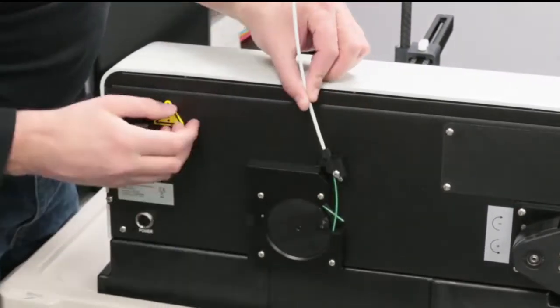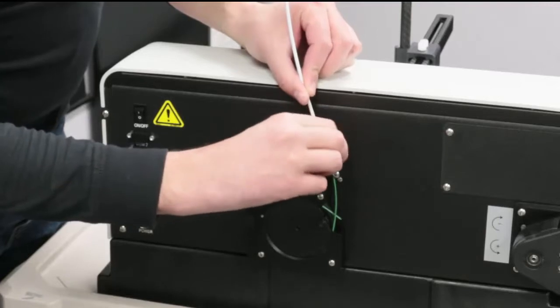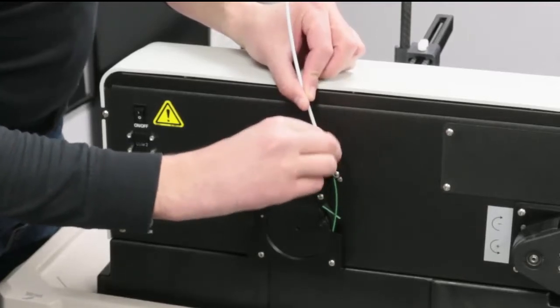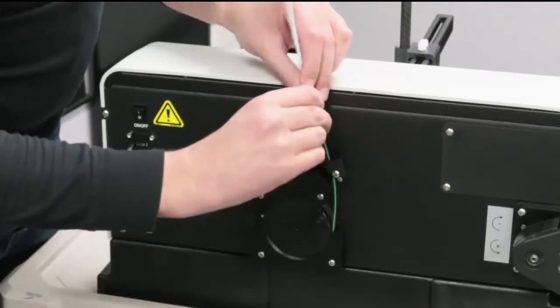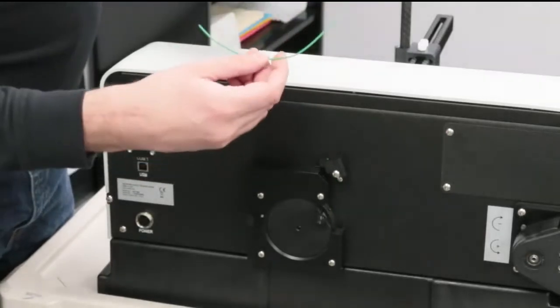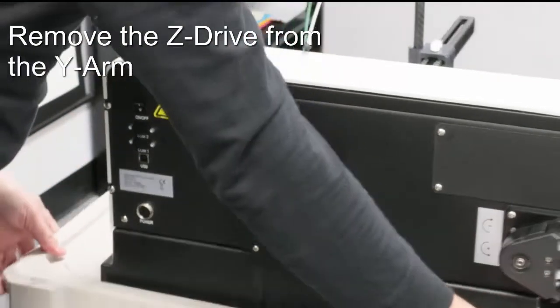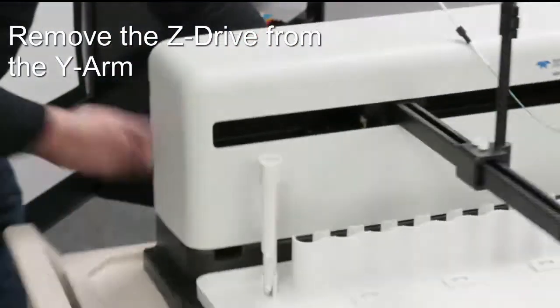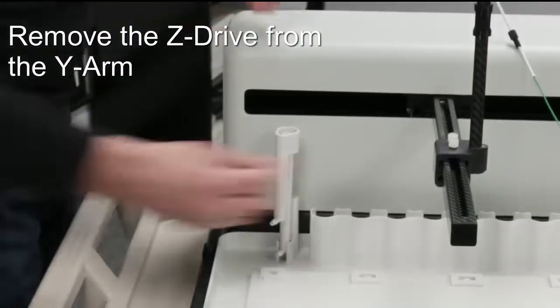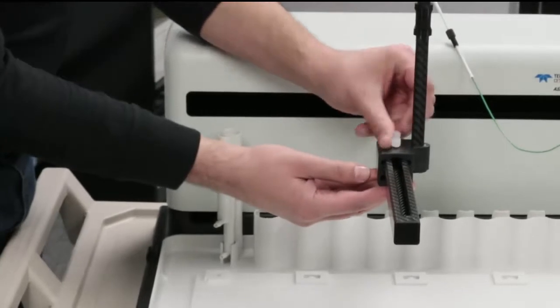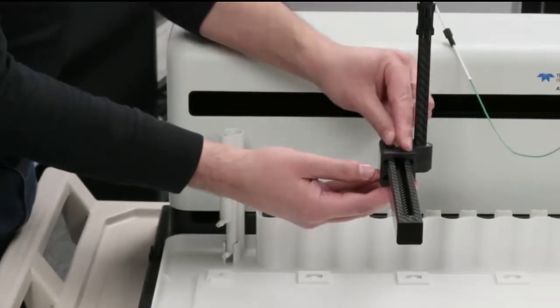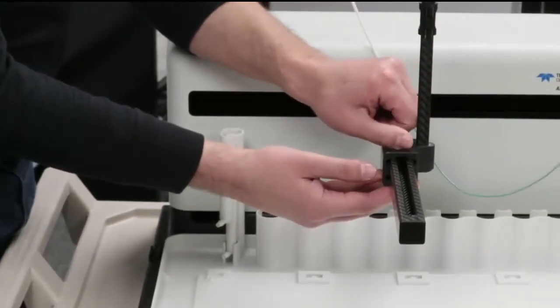Loosen the nut on the anti-kink swivel block. The entire peak cable can now be pulled out. Holding the Z drive to the arm are these two screws.